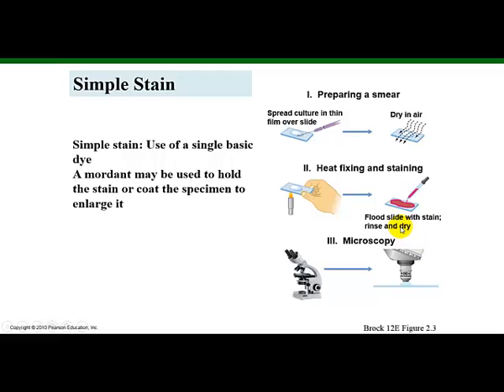Occasionally, a chemical is added to the solution in order to intensify the stain, such as a mordant, which will help to increase the affinity of the stain for the particular specimen.